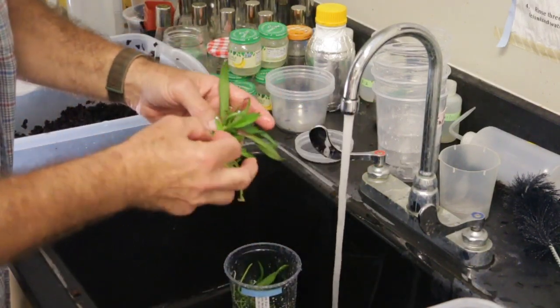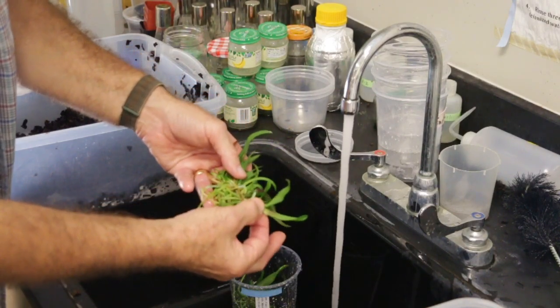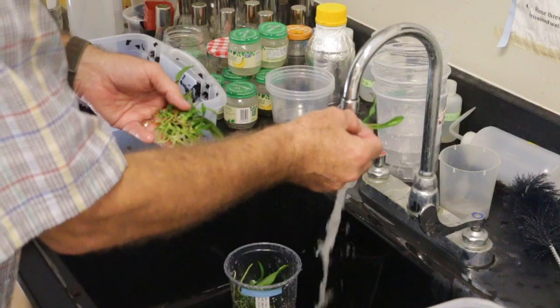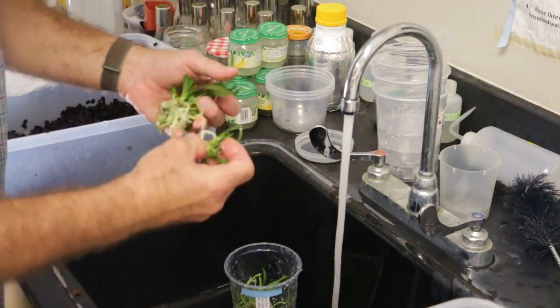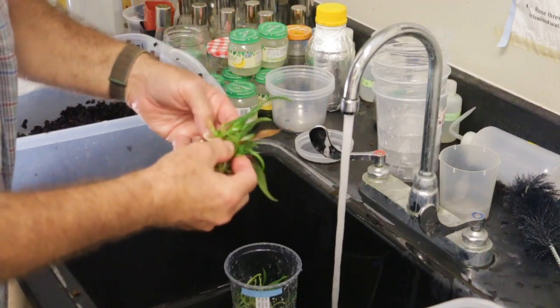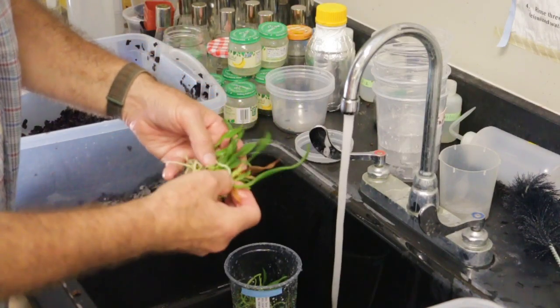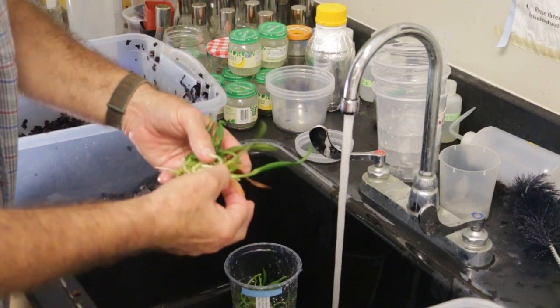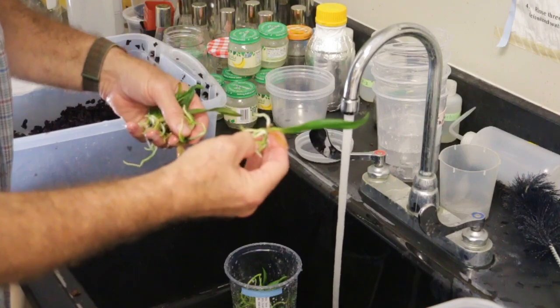Okay, but you have to work it. Here's another nice one right here, and then you grab it right here, and they just kind of fall apart. You can't tell from where you are, but they are stuck together a little bit. So you kind of have to keep working back and forth and see what you get out of it.